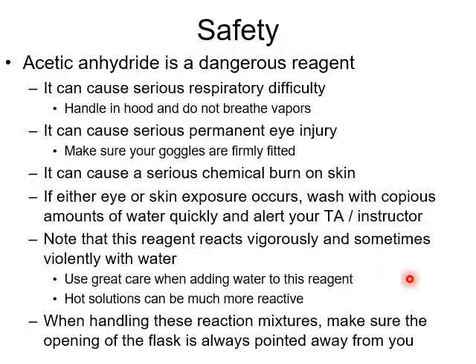This reagent reacts vigorously and sometimes violently with water. So you have to use great care when adding water, which is something that you do in this experiment. And you have to always keep in mind that hot solutions can be much more reactive. That's why you would use a water bath, for example, or a hot plate. And something that I have never mentioned to you until right now is that when you open a flask, it should always be pointed away from you. That also applies, for example, to the extraction funnel that you use when conducting extractions. So that's that.